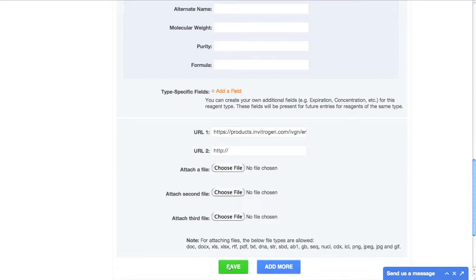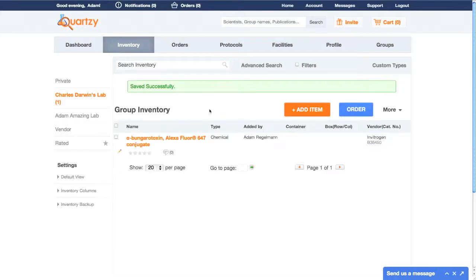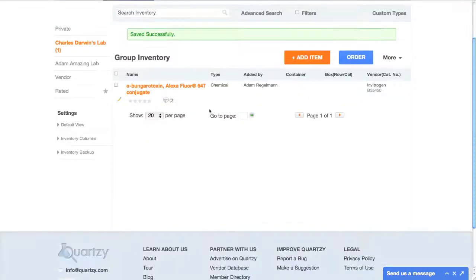Now, I just click Save, and presto! The item is in my inventory for all in my lab to see.